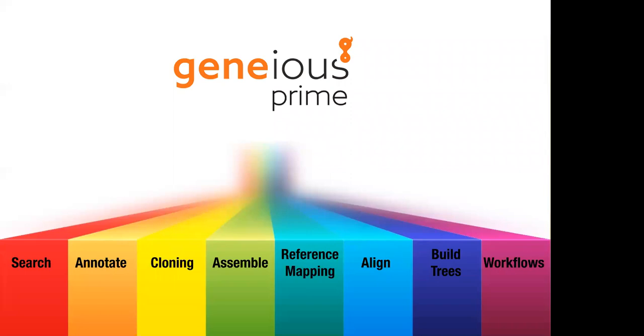So from Geneious, you can search sequences. You can look inside a sequence, find areas of interest, like finding repeats or finding motifs. You can search against external databases, like NCBI or UniProt. You can also run BLAST searches, either against NCBI or against local custom BLAST databases. So if you have a particular genome you're working with, or a collection of genes, or maybe it's proprietary sequences, you can create a local BLAST database in Geneious and search directly against that.